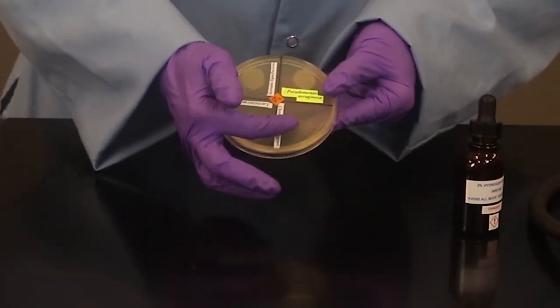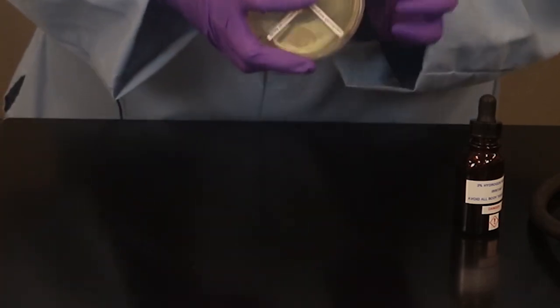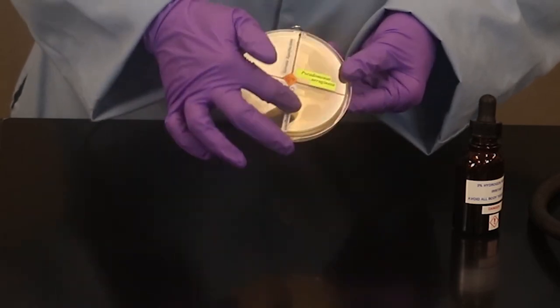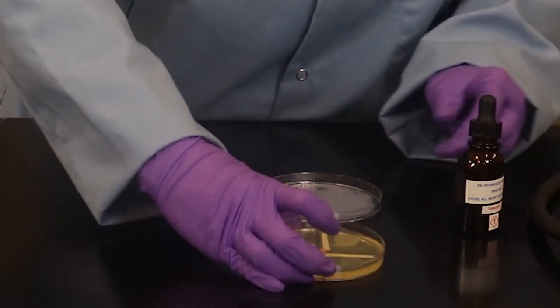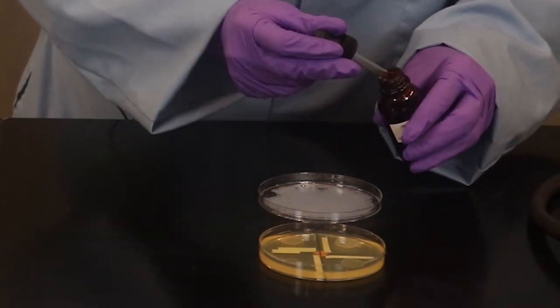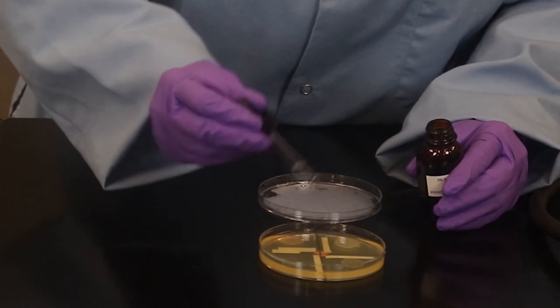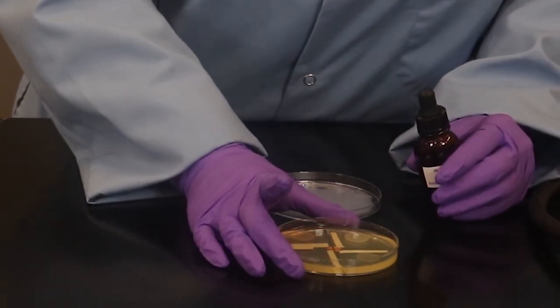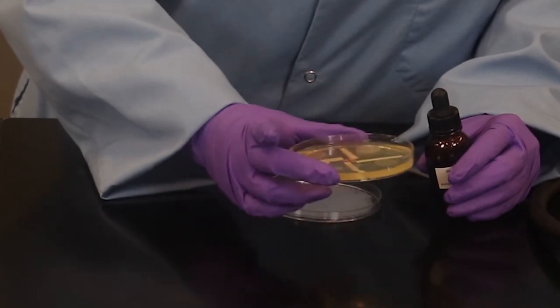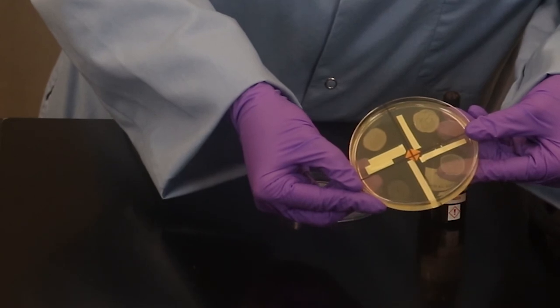And that's our Clostridium spirogenes. It did not grow aerobically. It did grow a little bit on the anaerobic plate. So we're going to test the catalase reaction from this particular plate here. After the addition of hydrogen peroxide, there's no bubbling occurring here. No catalase reaction.